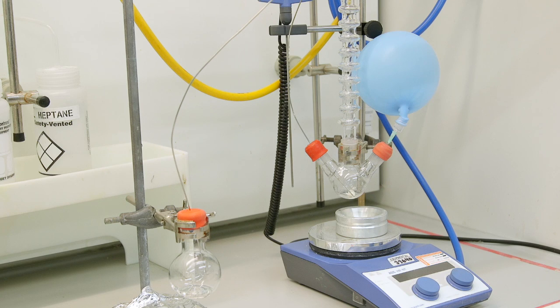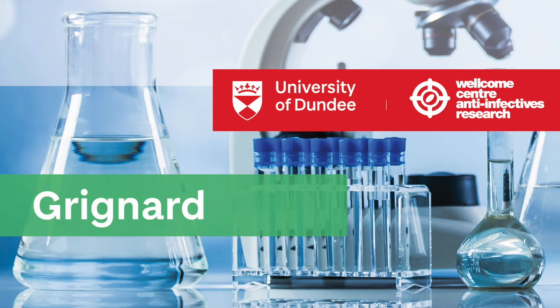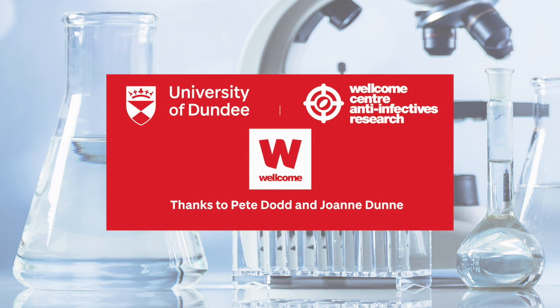We can now use our Grignard in future synthetic steps. In this short video we have set up, carried out and synthesized our Grignard.